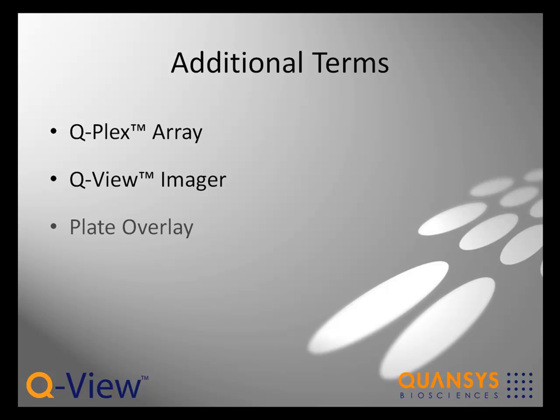Plate overlay refers to the diagram of the plate that is aligned by the user over the plate image. Product code is the alphanumeric code that defines parameters such as the number of spots per well and their positions, the concentrations of each analyte in the calibrator, and the optimal curve fit settings.